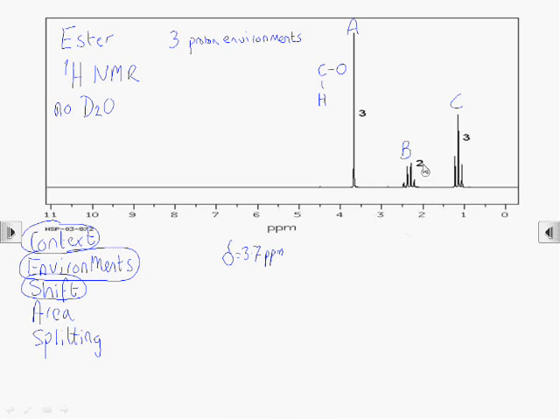Peak B, then, at 2.4 parts per million. That's a hydrogen on a carbon connected to a carbonyl group.